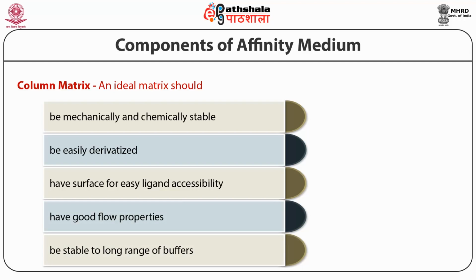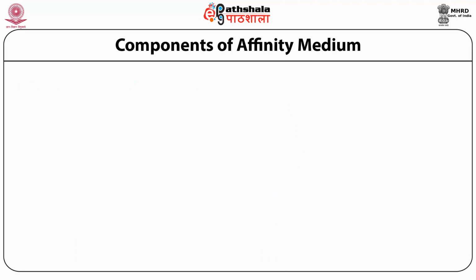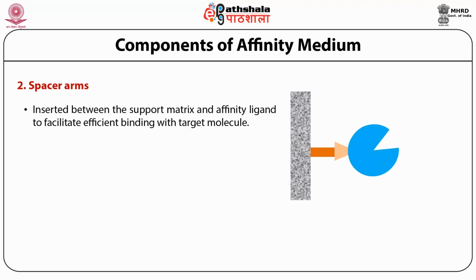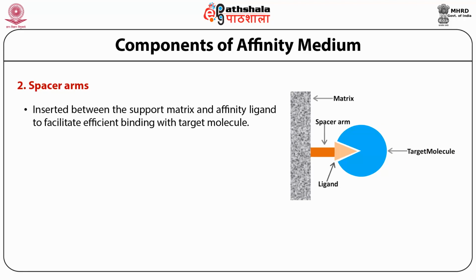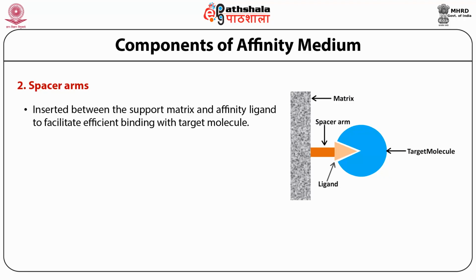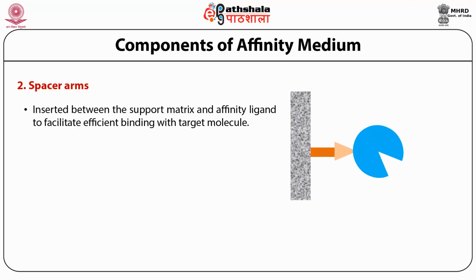Another important component is spacer arms. A spacer arm, which is shown on the screen, is usually inserted between the support matrix and the affinity ligand that facilitates proper binding with the target molecule. The spacer arm is helpful in providing a more effective binding environment.